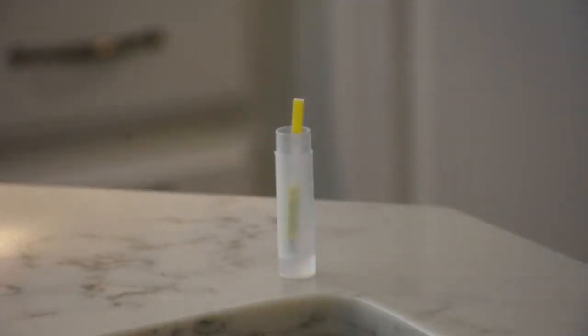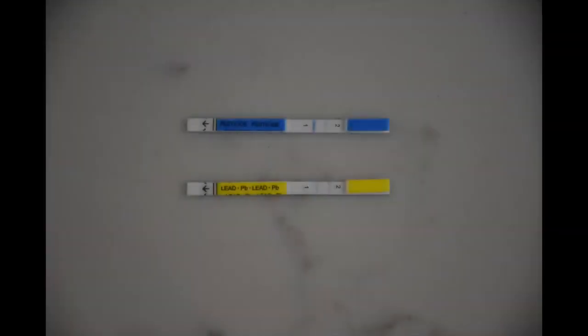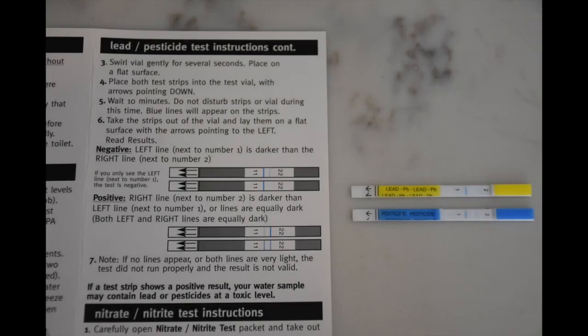Place both test strips into the test vial with the arrows pointing down. To read the results, remove the strips from the vial and place them on a flat surface with the arrows pointing left. Refer to the instruction leaflet to interpret the results.